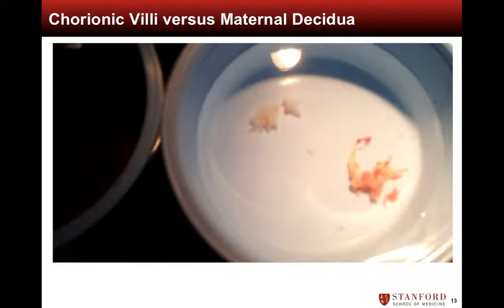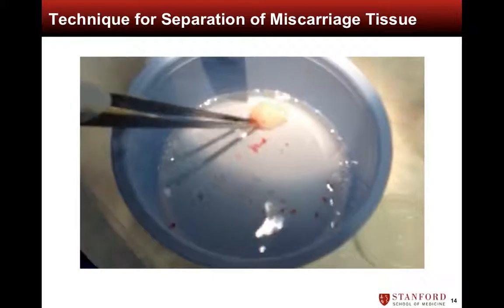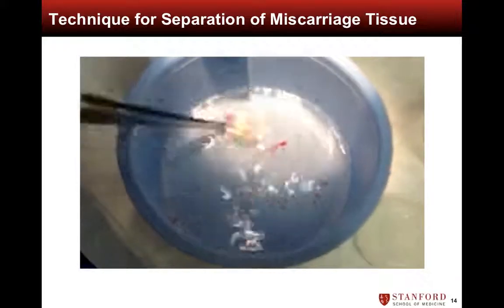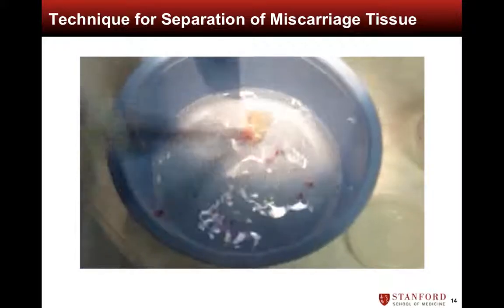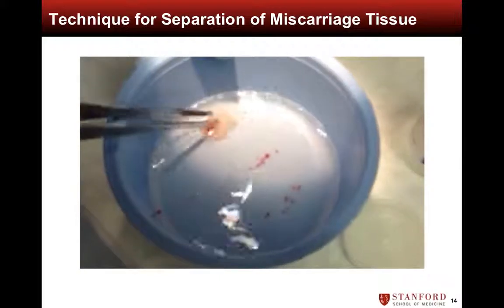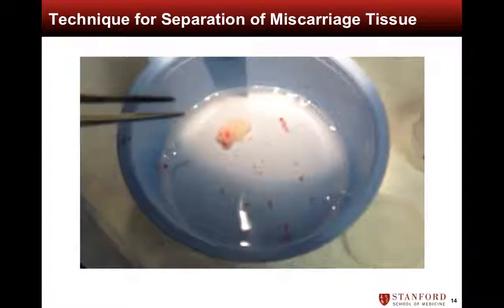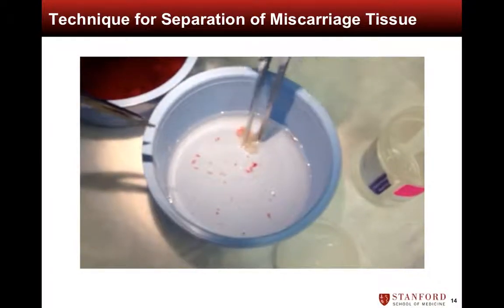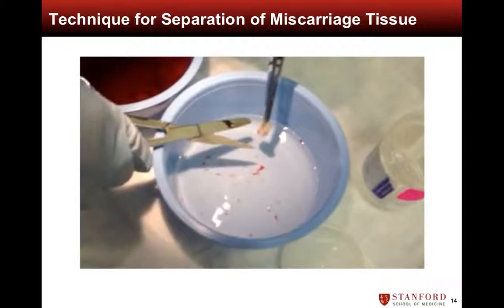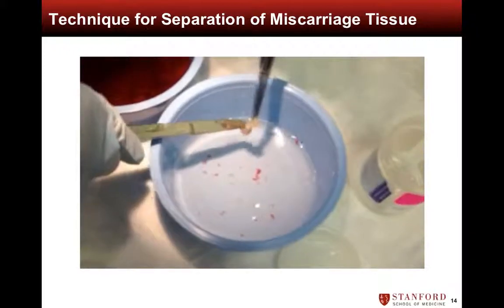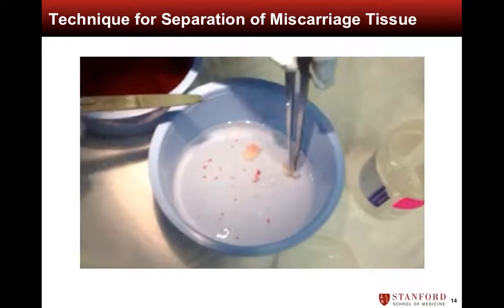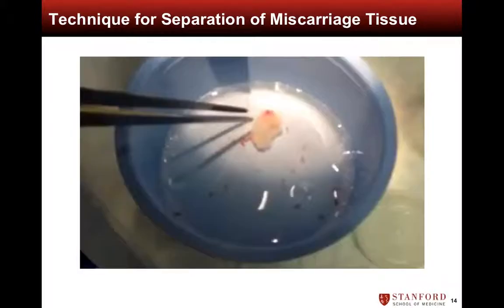Once villi have been isolated from the miscarriage specimen, the next and final step is dissection of decidual tissue off the villi. Maternal decidua, which can be visually identified as pinkish-red in color, can be separated from the chorionic villi by grasping the tissue with smooth pickups and agitating the specimen as shown in this video. If this is unsuccessful, the tissue containing both decidua and villi should be incised completely from the specimen, leaving only chorionic villi for chromosome analysis.